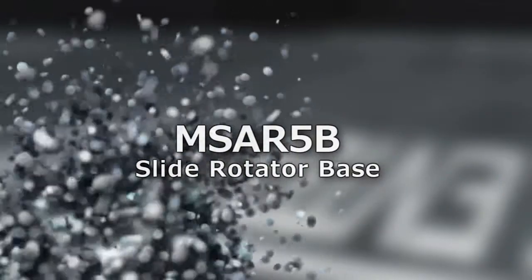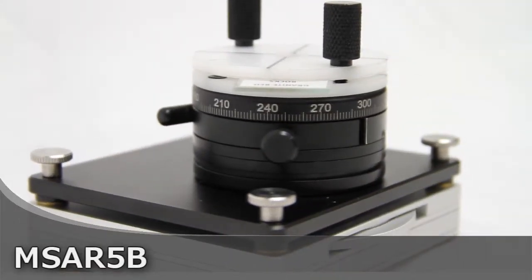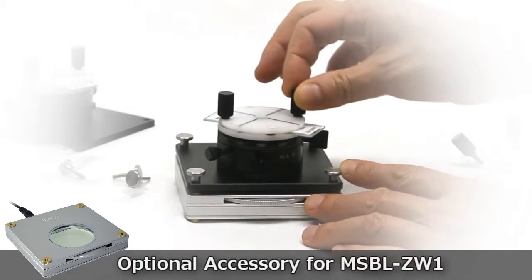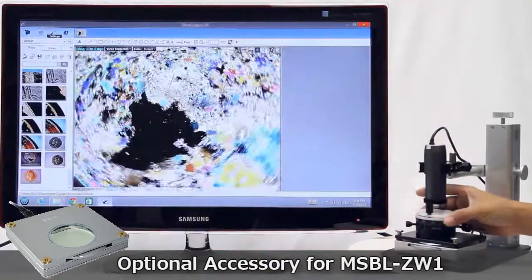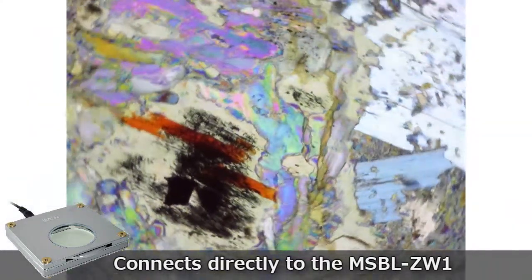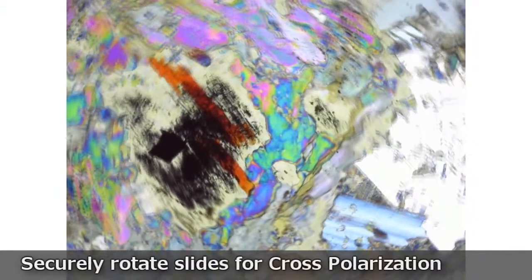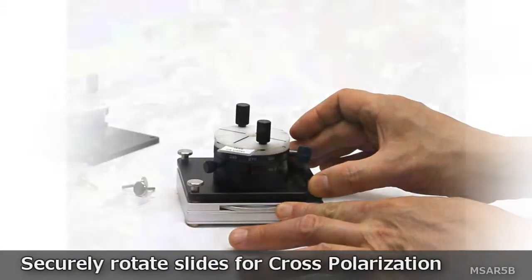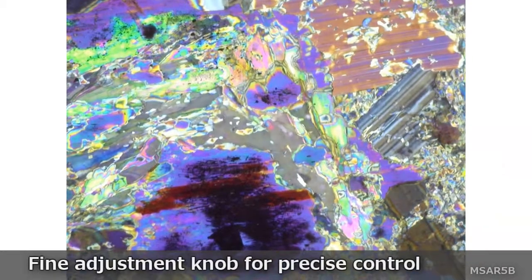Introducing the MS-AR5B Rotating Stage, an optional accessory for the MS-BL-ZW1 Polarizing Backlight. The MS-AR5B allows users to easily and securely rotate a slide on top of the MS-BL-ZW1 for polarization viewing purposes.